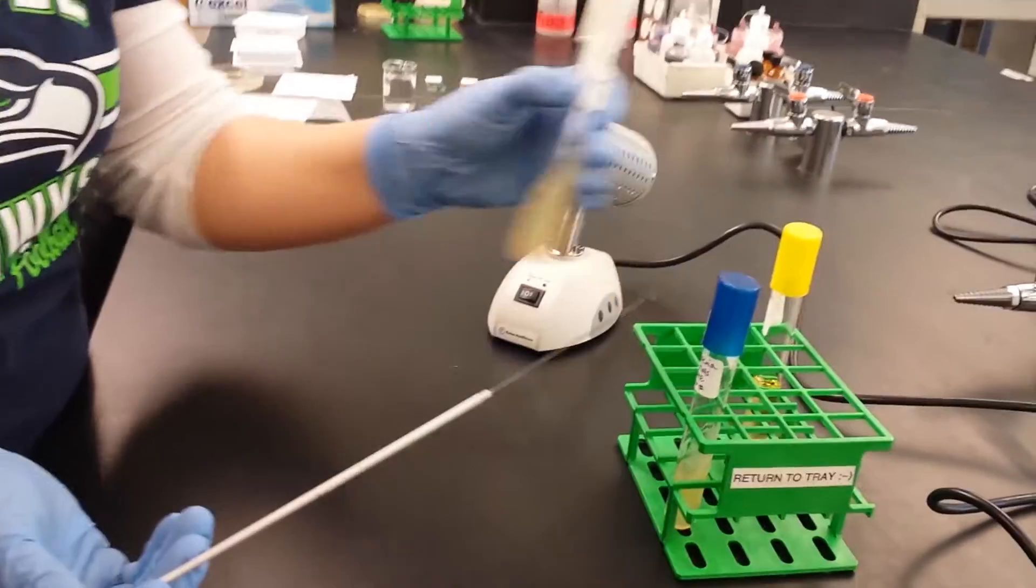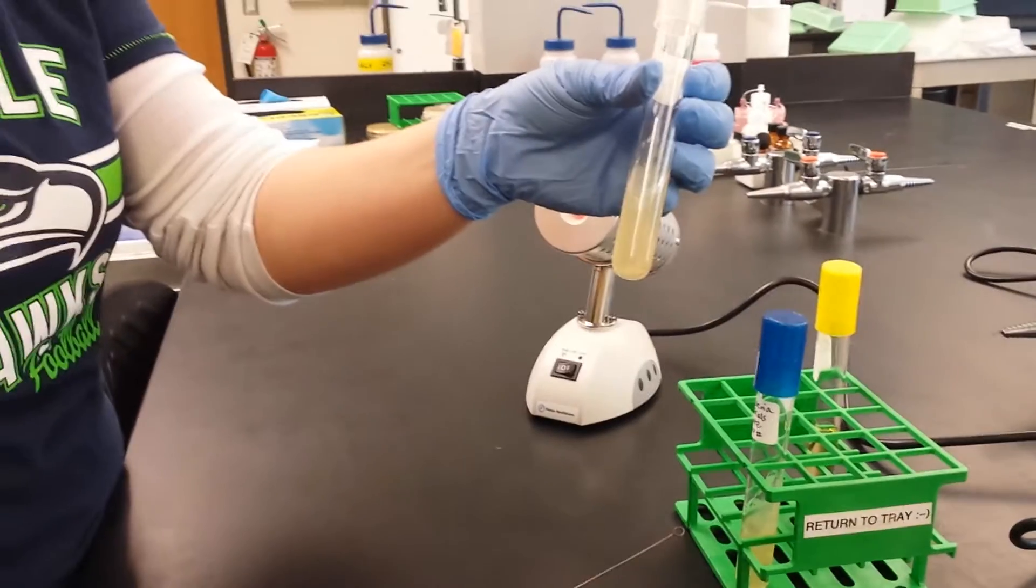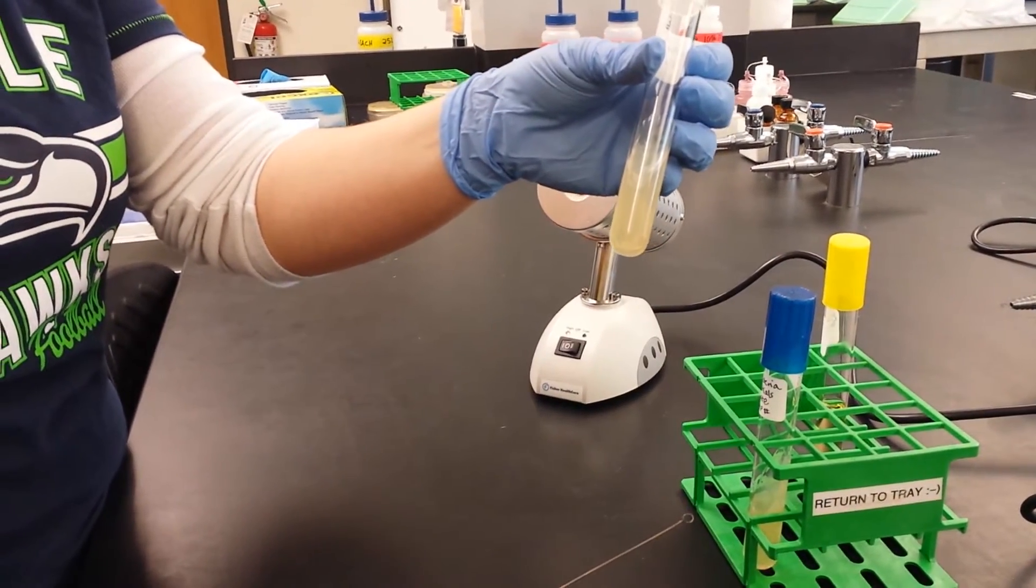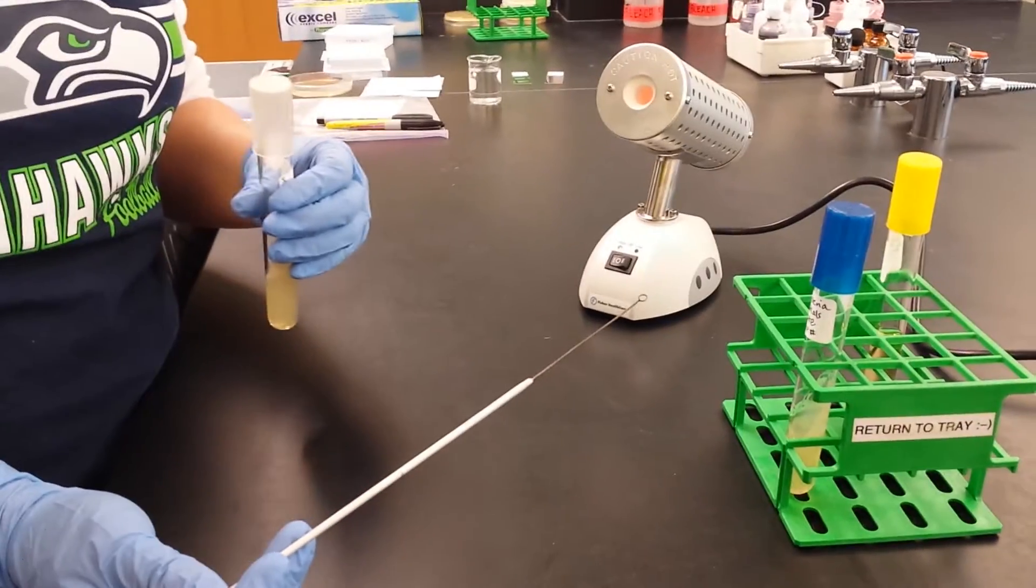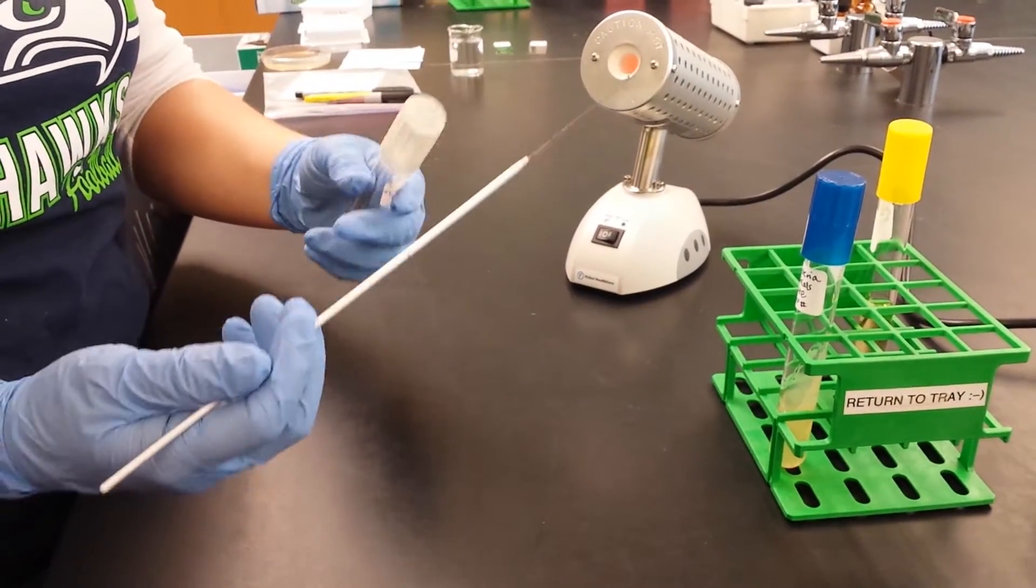Then I'm going to pick up my culture tube. So there's growth on this slant, and I'm going to touch down to that slant. You need to make sure you cool your loop for about 20 seconds before you put it in to the test tube.